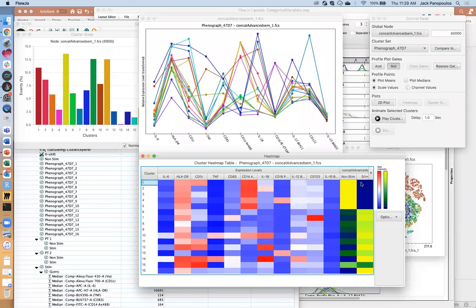If I move next door to the stim, you can see that cluster number 1 has very few events that come from the stimulated condition. The stimulated category has only 40 cells, roughly 1% of total. So the first 5 clusters are probably identifying basal state cells, not activated.